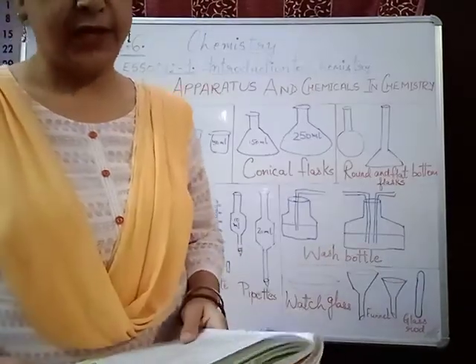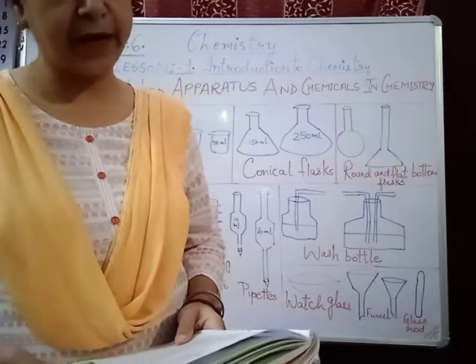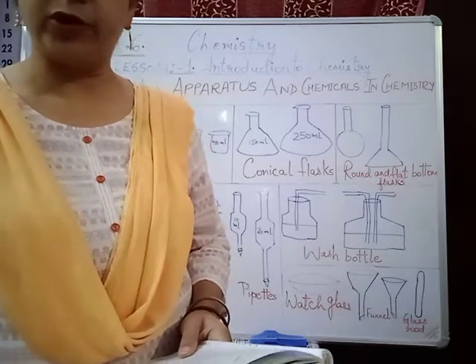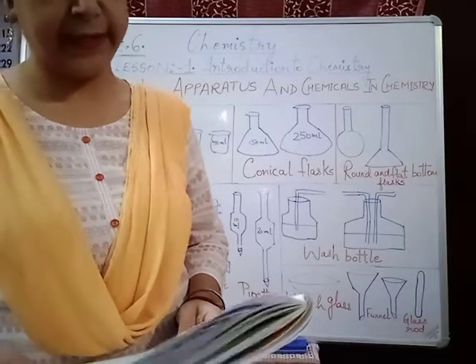Test tube brush. It is like a bottle brush used for cleaning the test tube. It is smaller in size than a bottle brush. So children, with water and with your hand you cannot clean your test tube. You need to have a brush. So there is a test tube brush to clean it.